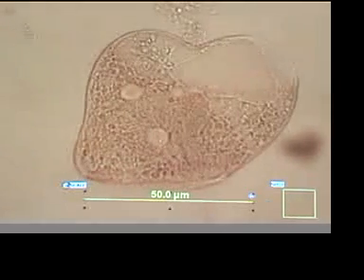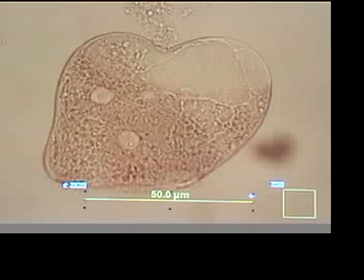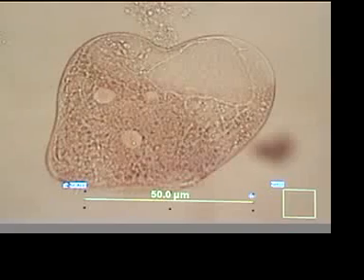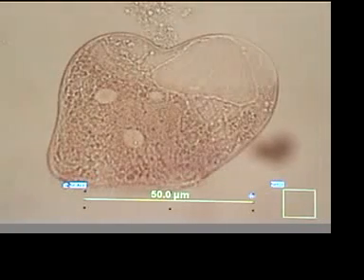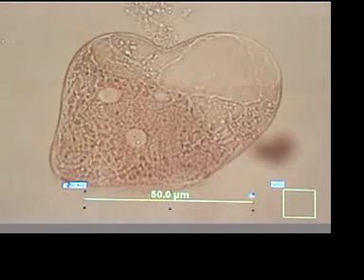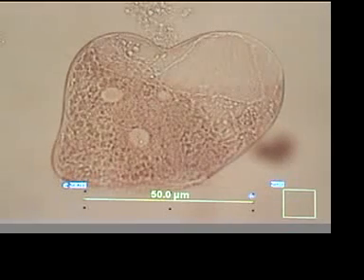That's me adjusting the microscope stage, so now I'll leave it steady. This is happening in real time, and now you see the outer shape is really a completely different shape now. It's been very badly distorted, and we'll see what happens to the internal structures.